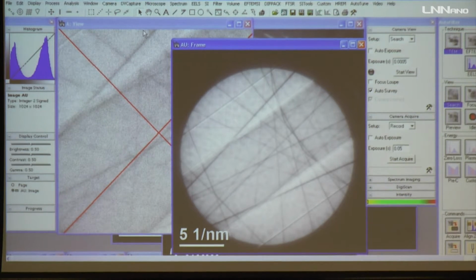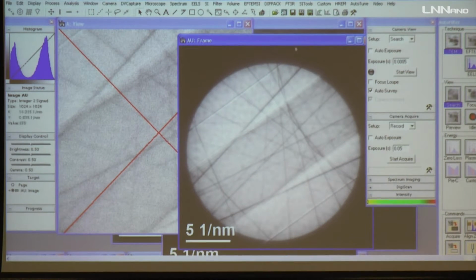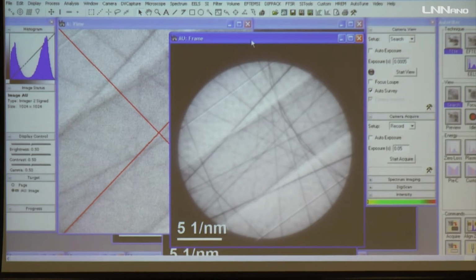First, starting with CBIM, CBED versus CBIM. CBIM is the convergent beam imaging technique. This micrograph is the CBED technique. The one we have acquired, which I'm showing here, was acquired using the CBED technique. Now I will try to acquire using CBIM.